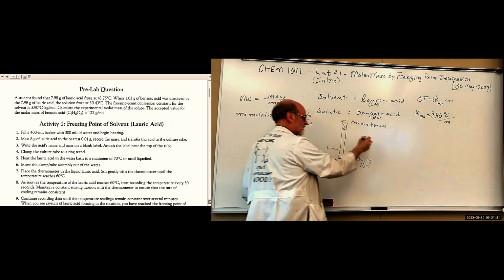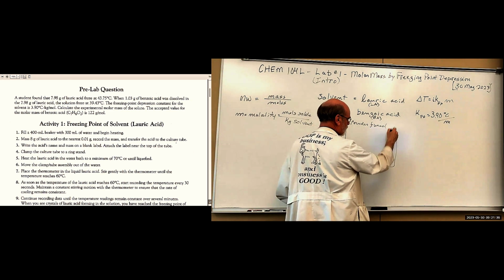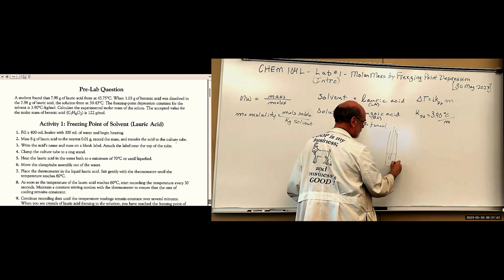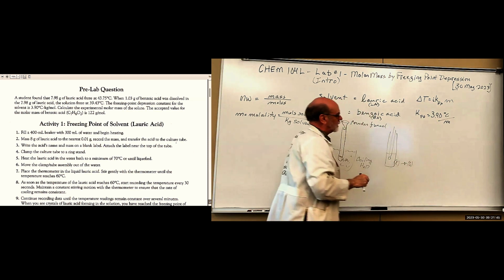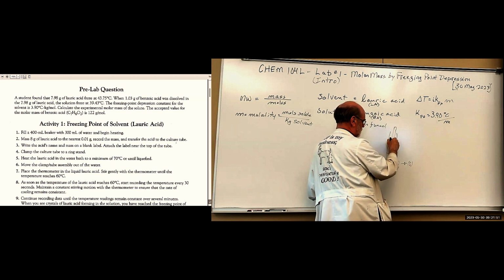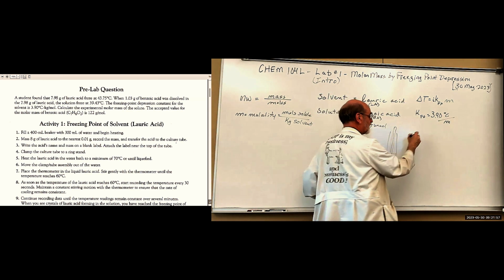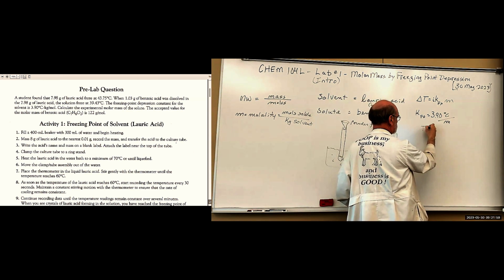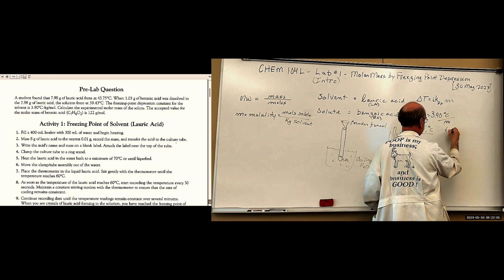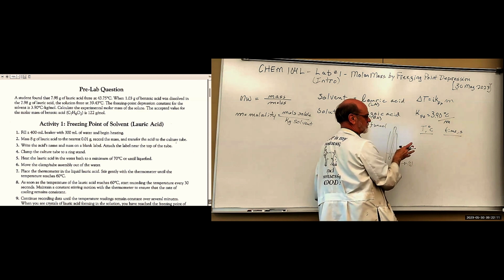So we'll pull it out of this. Right? That's an expanded view here. And we're going to stick a thermometer in it. And it starts off, as the temperature changes, this thermometer is going to go from a high to a low. So you're going to have a list here of temperature and time in seconds. You can put the time on this side if you want, that's fine.